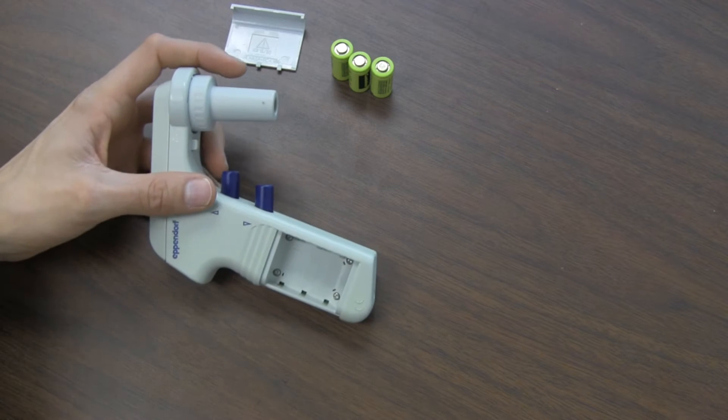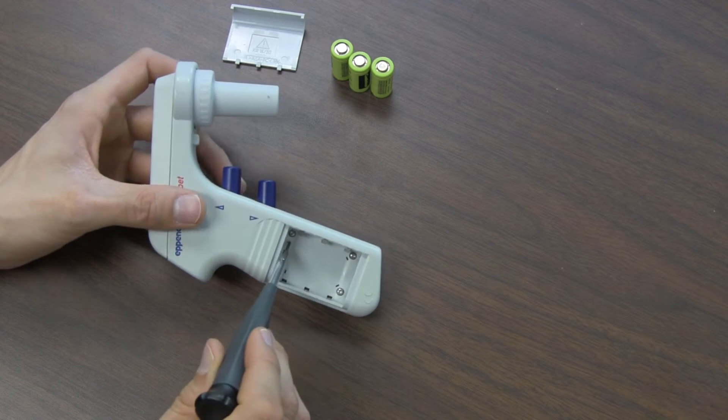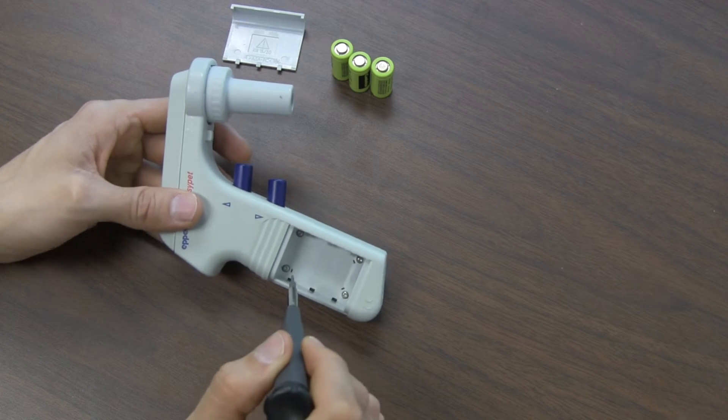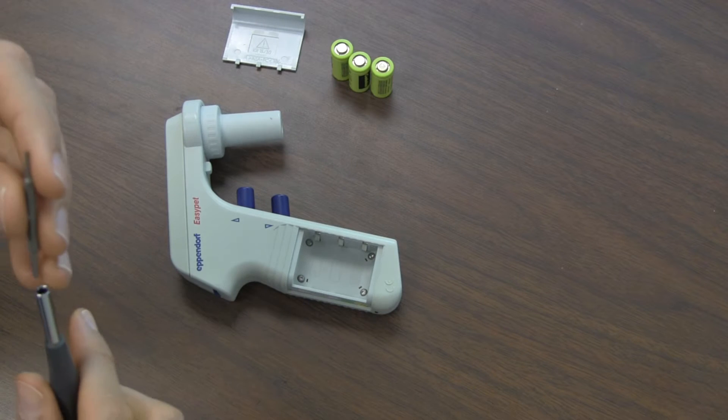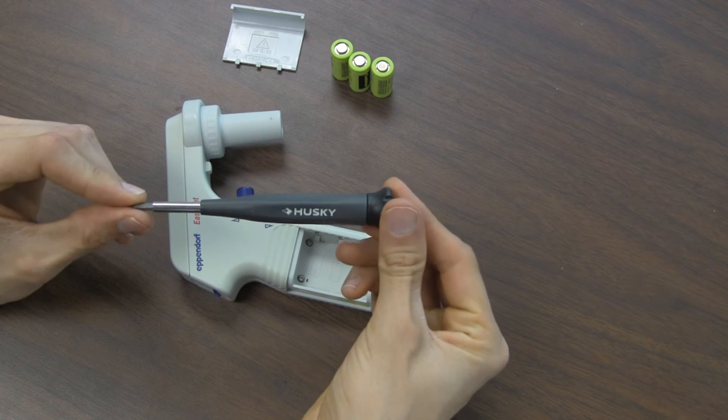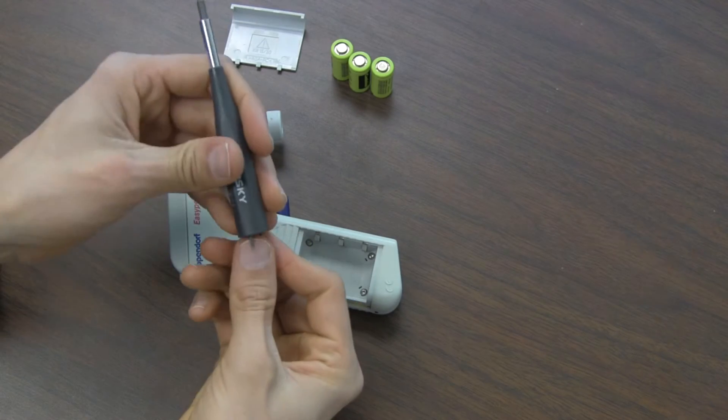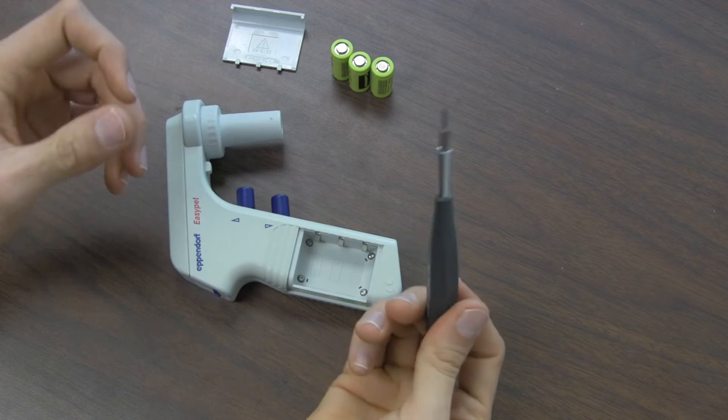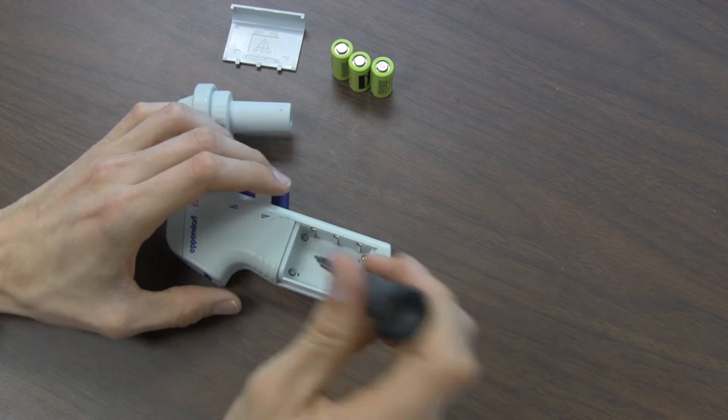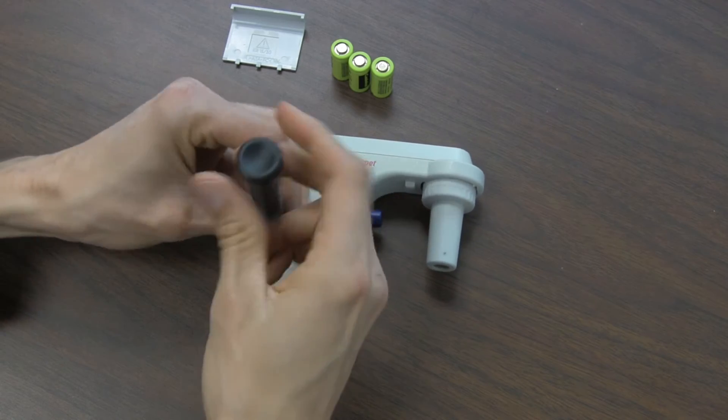And then you'll find on the inside of the battery compartment these four screws. And these screws are Torx screws. They are T6 Torx, so you can buy from Home Depot, Husky brand screwdriver, which has several Torx bits in it. And this screwdriver is five dollars. It'll allow you to undo these screws. So it's pretty easy, you just remove these screws.